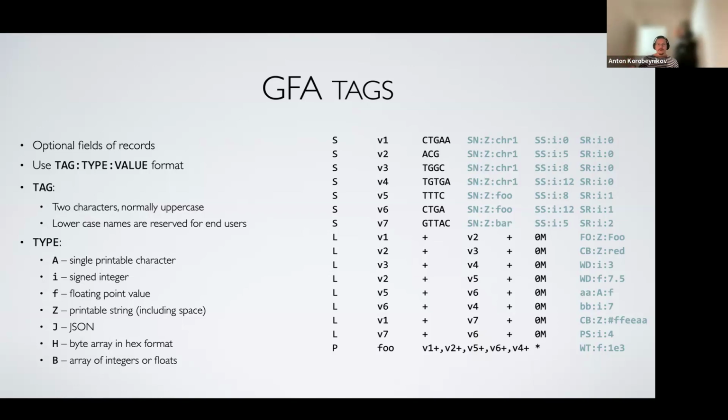Another interesting thing is that tags are typed. So each tag essentially has a tag, type, value format, separated by the colon symbol.